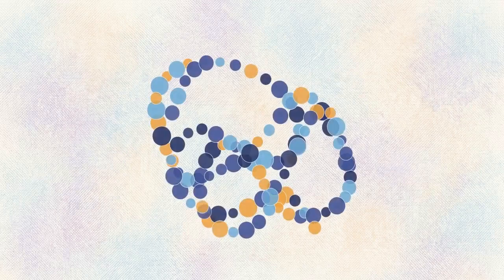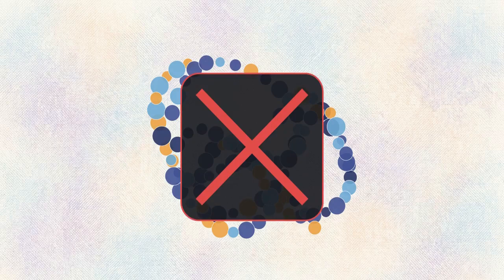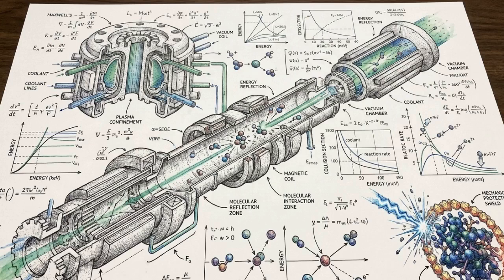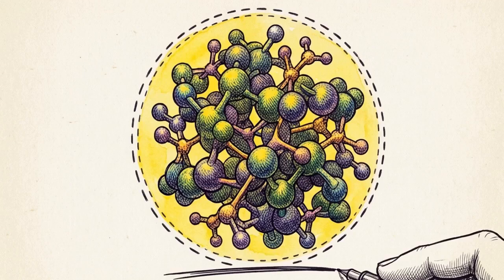This physical limitation kept scientists from analyzing the massive, fragile molecules that actually drive biology, like large proteins or polar salts. They would simply disintegrate before they could be weighed. Analyzing these biological giants required researchers to solve a specific physics problem: how to impart enough energy to charge a molecule without shattering its chemical bonds.